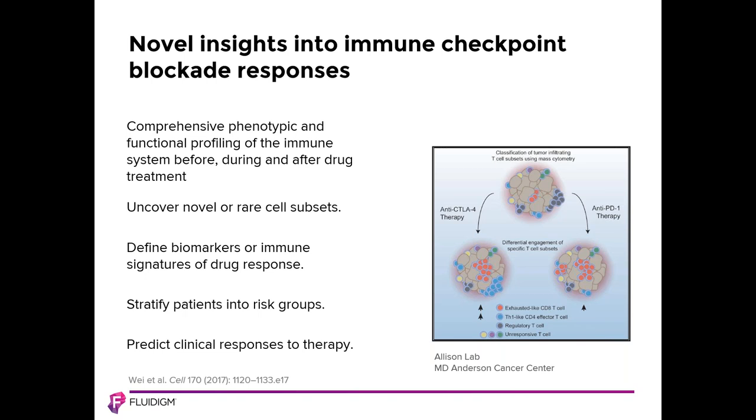Let's take a look at some papers that investigate the immune response to checkpoint inhibitor therapies using mass cytometry and imaging mass cytometry.